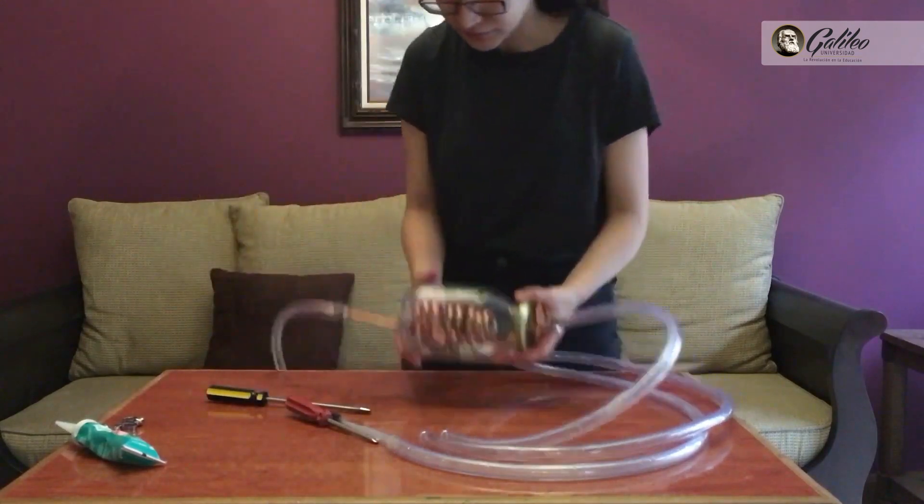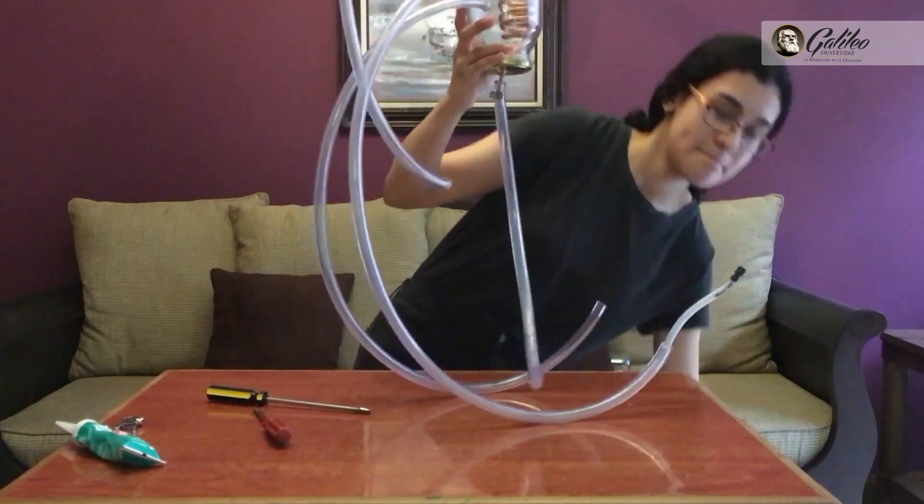The project consisted of the construction of a distillador casero based on the materials that we had at home, like for example a glass container more or less large for the condenser, a fuel source, and a distillation vessel, which in this case would be a pressure cooker or a coffee maker. The use of this project would be the distillation of a ferment that we are also preparing at home, and also the distillation of essential oils.